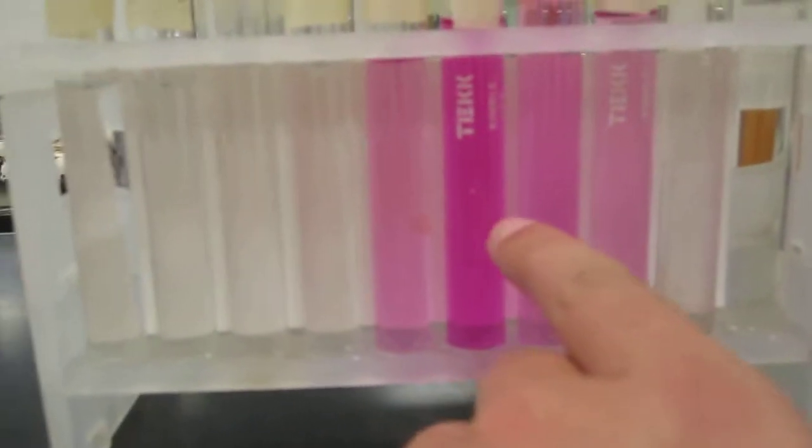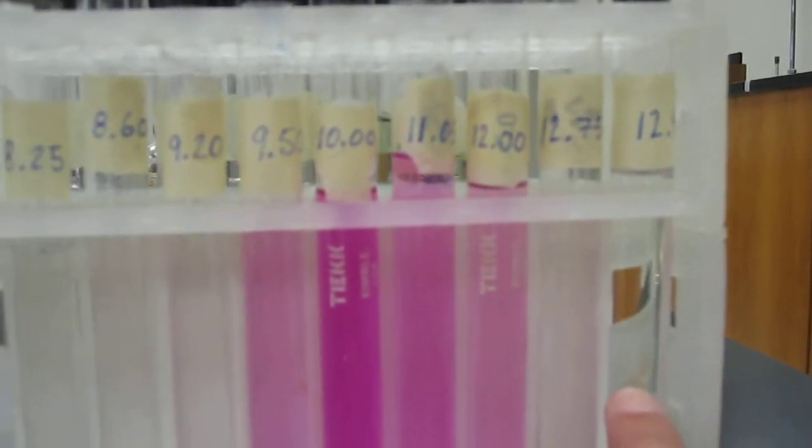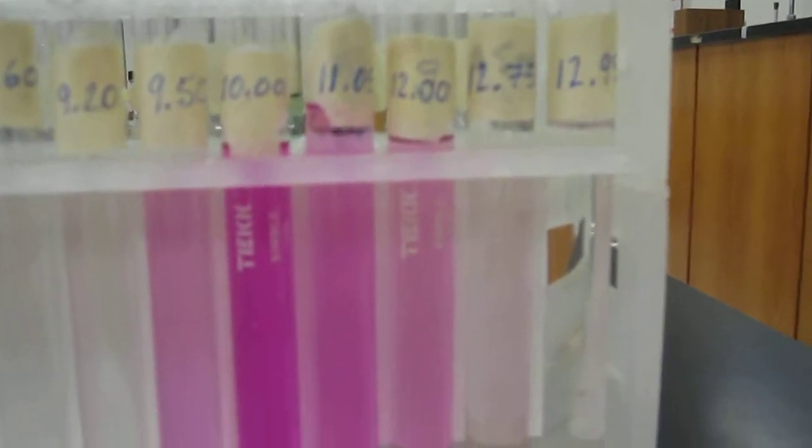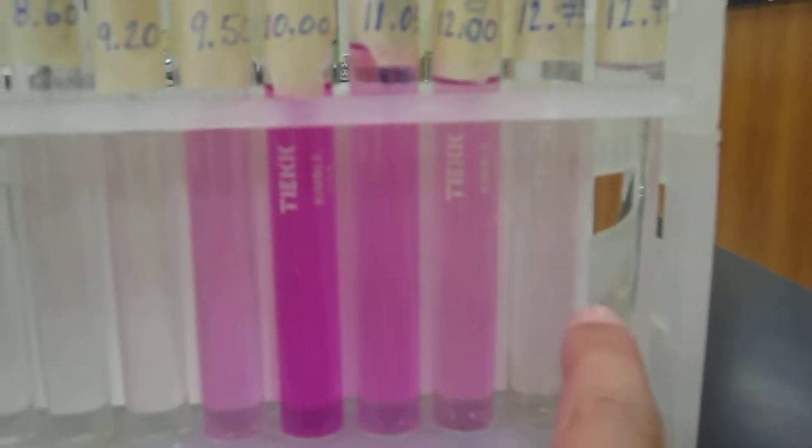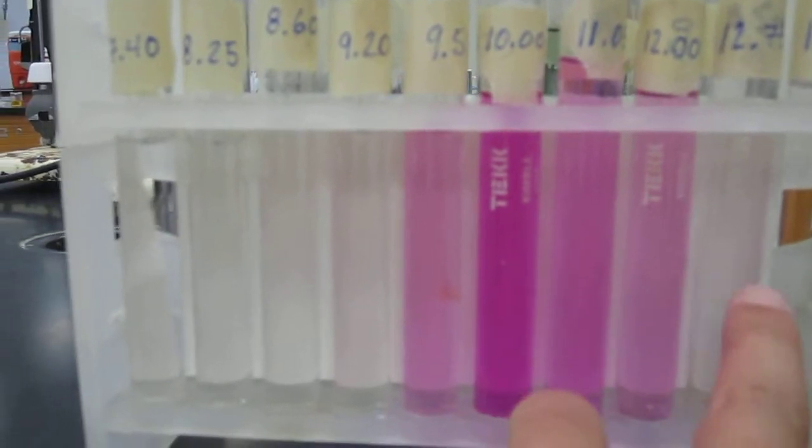And then it actually lightens in color to when it gets to about 12.8 or so, there's no more pink seen. So it goes from colorless to pink, and then back to colorless. So that's phenolphthalein.